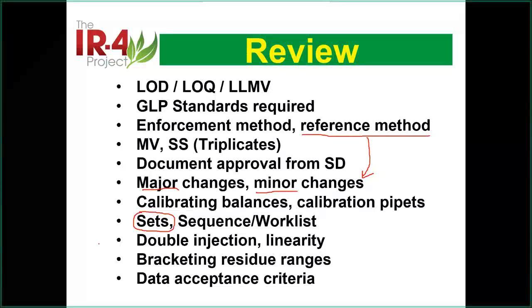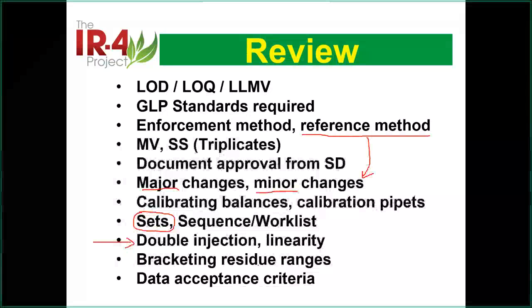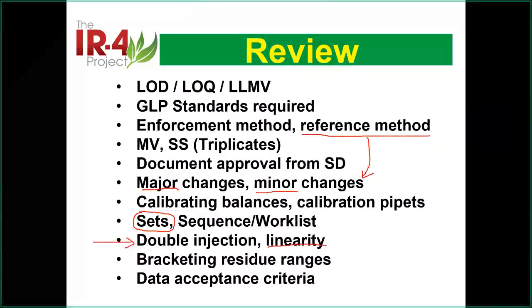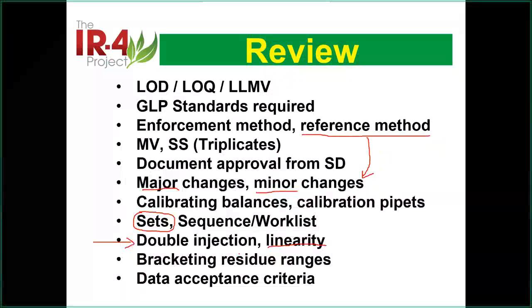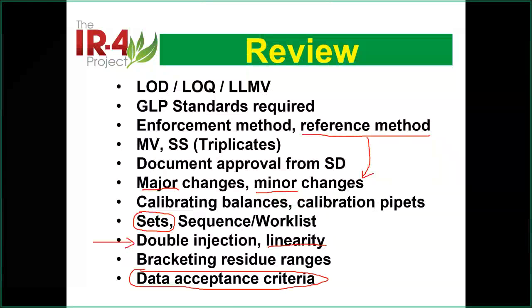There's duplicated data to do double injection, what the acceptance criteria are, and linearity, or all those calibration matters. I also mentioned briefly that if your residue is very high, you need to have a validated level to cover this range. The last thing, we spent probably about 5 minutes talking about the data acceptance requirement.